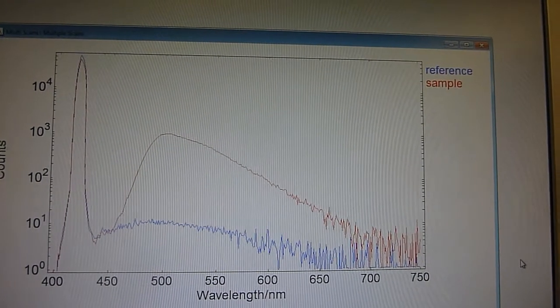And now it's telling me I have a quantum yield of about 93%. Now let's take a look at the integrating sphere itself. Let's come over to the spectrometer.